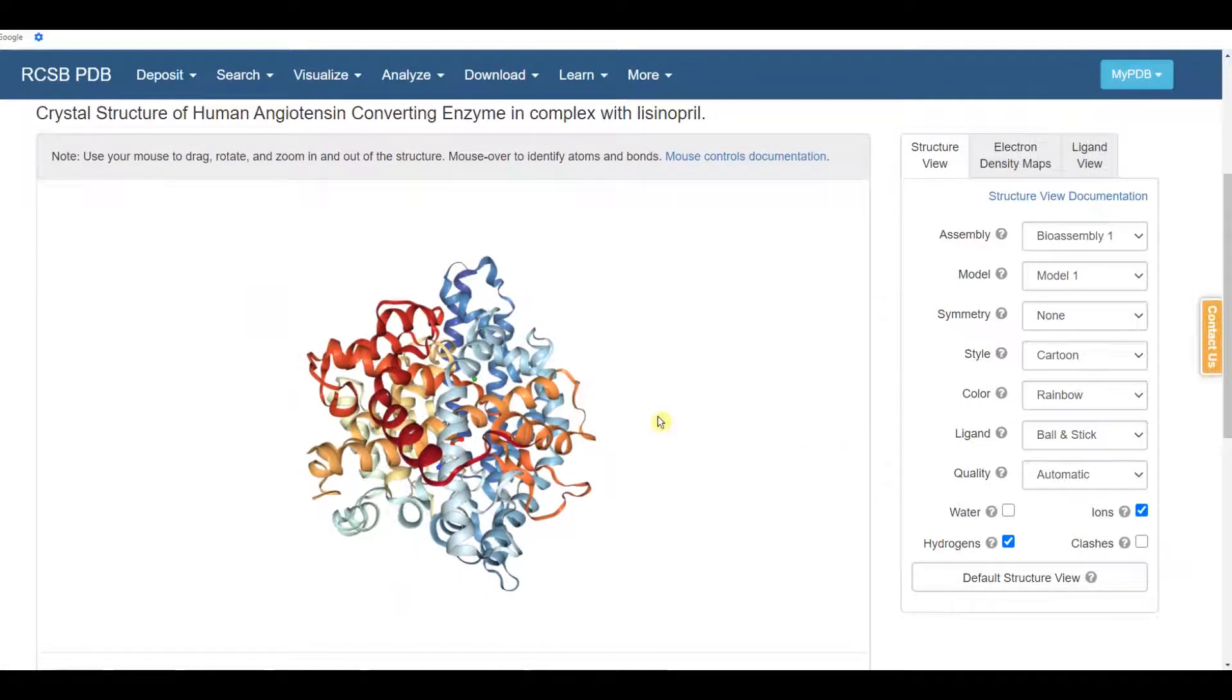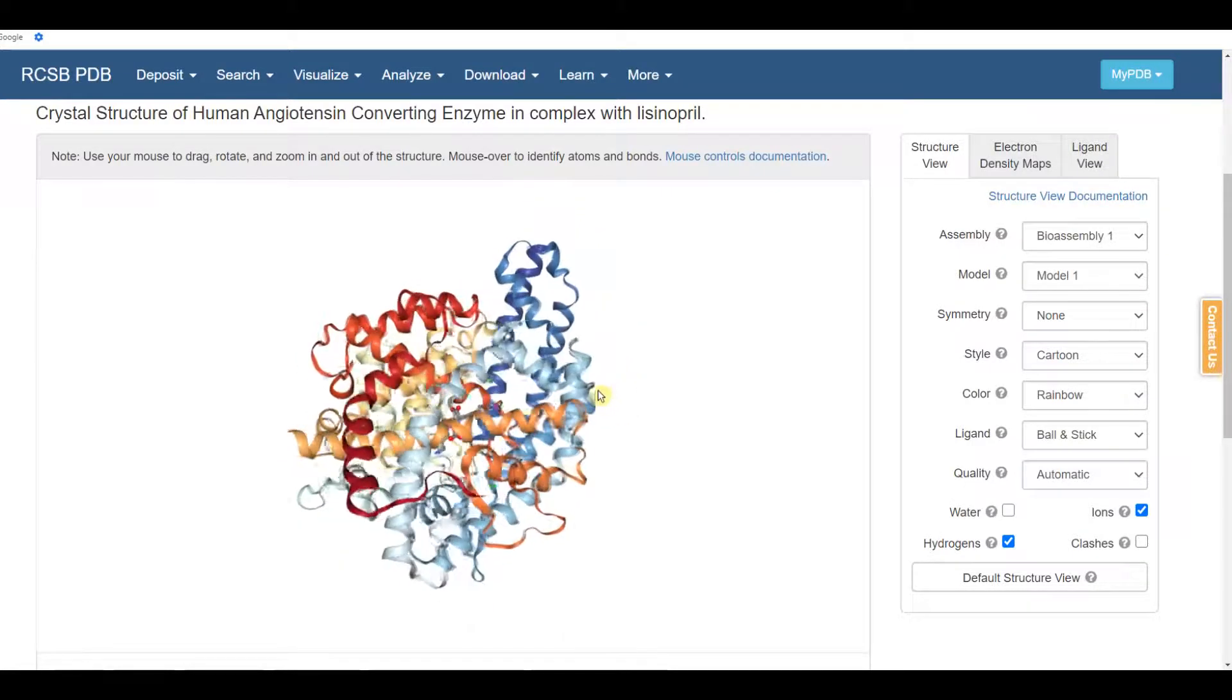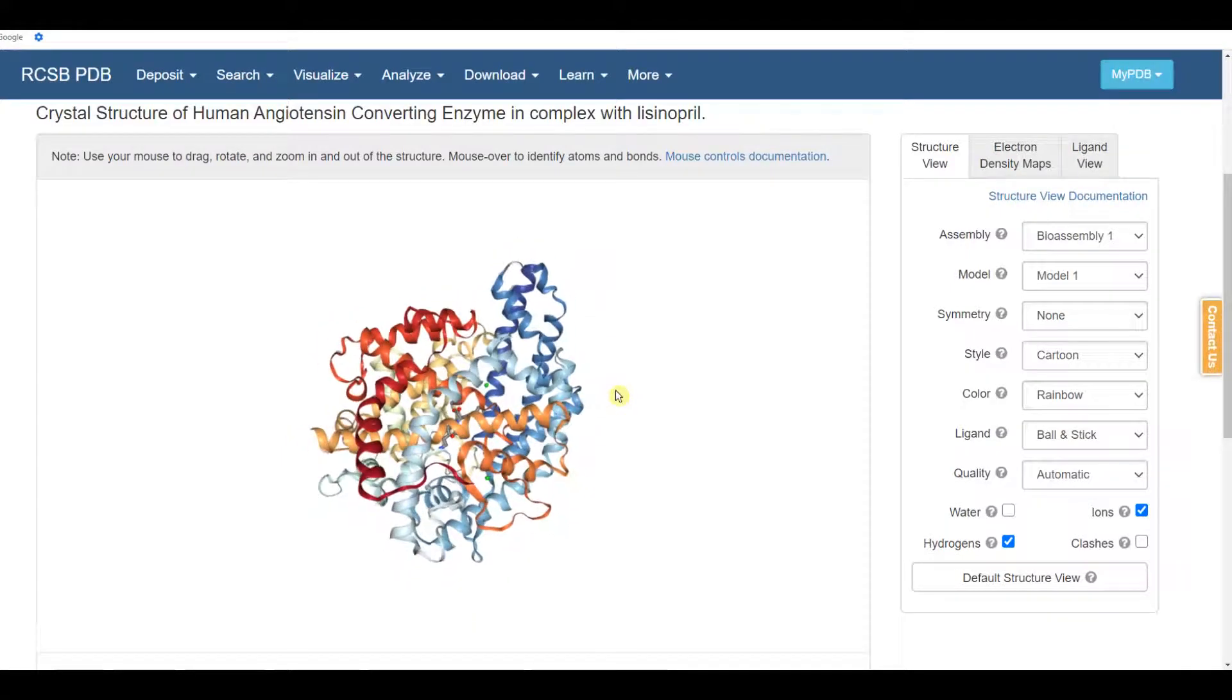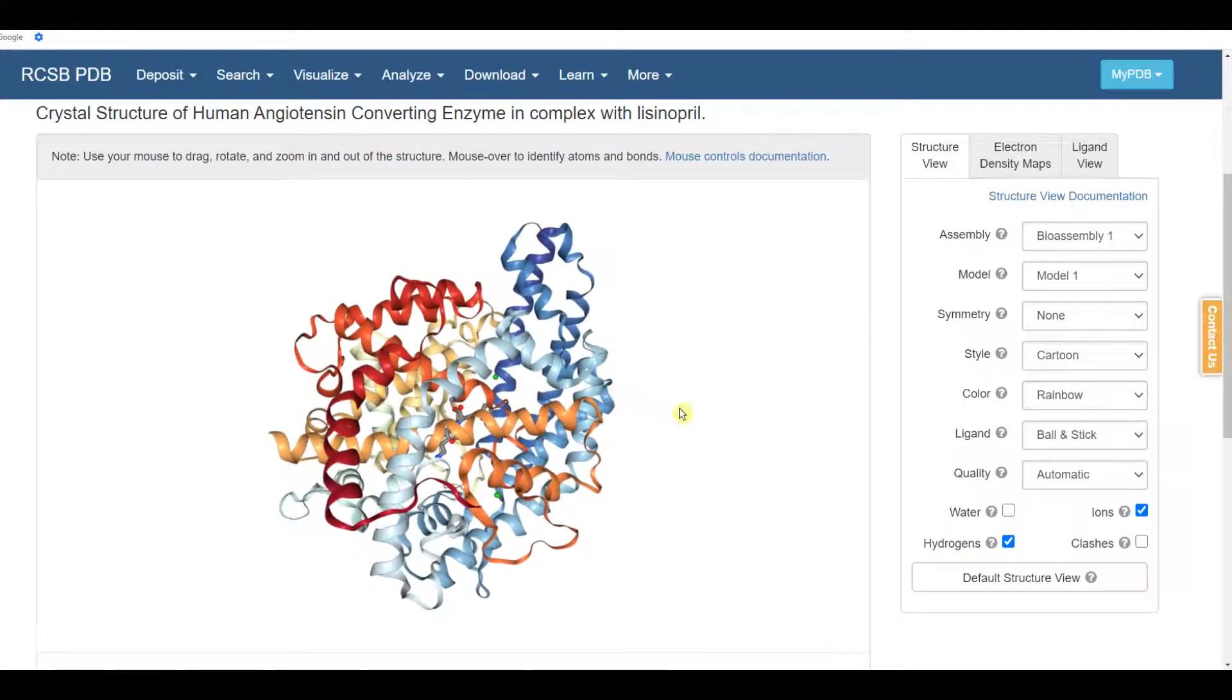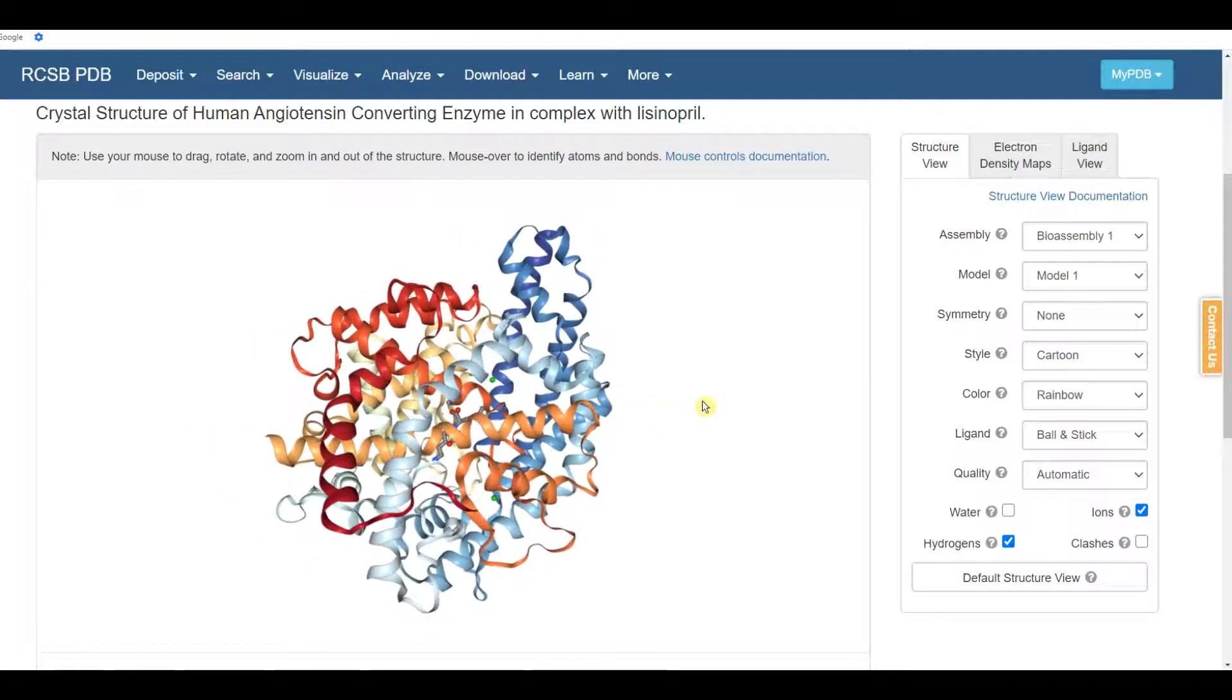Here is our cartoon form for this protein. We can click and drag with the left mouse button and rotate the structure. We can zoom in and out with the mouse wheel, and if we right click and drag, we can transpose the structure in the window.